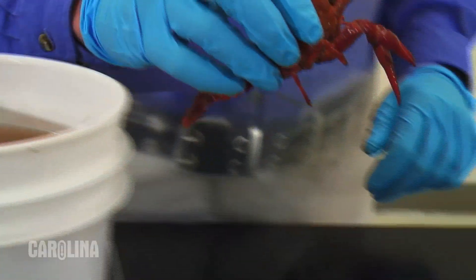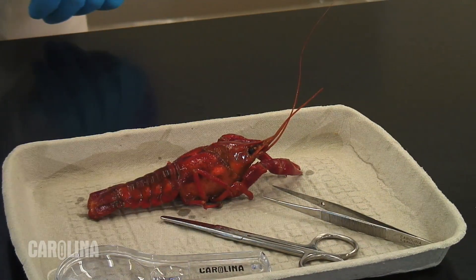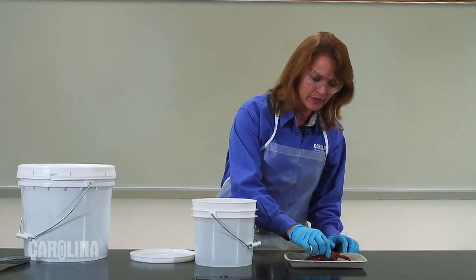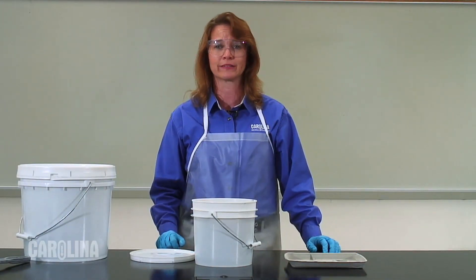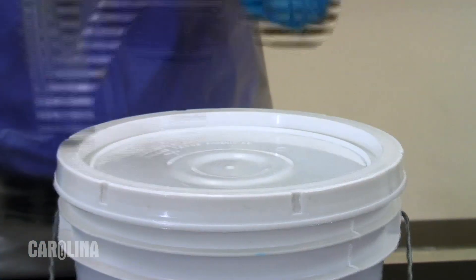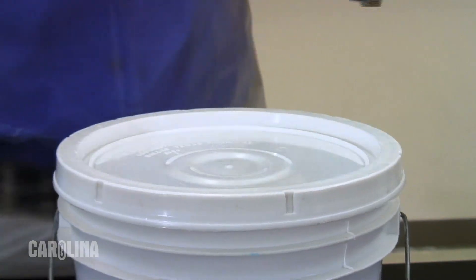We can ship various specimens in the pails, and they come in convenient one to five gallon sizes depending on your dissection needs. When you're ready to return the specimen to the pail for storage, make sure there's enough fluid to cover all the specimens. Please contact us if you need more fluid for your pail. Our fluids are proprietary, and we can help you in getting more. You can use the pail opener as a hammer to close the lid and make sure it is sealed properly.